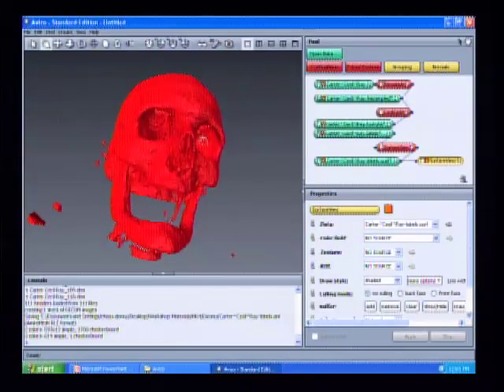It's really, really rough. And so what we need to do next is go through a series of smoothing steps in order to get this skull model down to what we feel is smooth so that you can view it, but not too smooth because we don't actually want to remove the features that we're looking for.